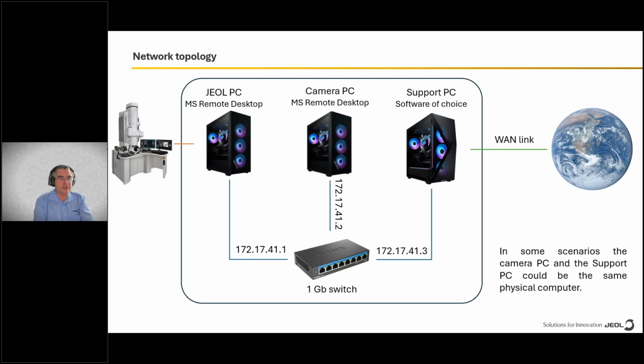Let me first explain the network topology. I would like you to understand that the microscope is just one single giant computer, and in fact there is an embedded computer locked inside the microscope. This computer is not easily accessible. In fact, you never log into it. Service engineers do it occasionally when they have a particular service need.